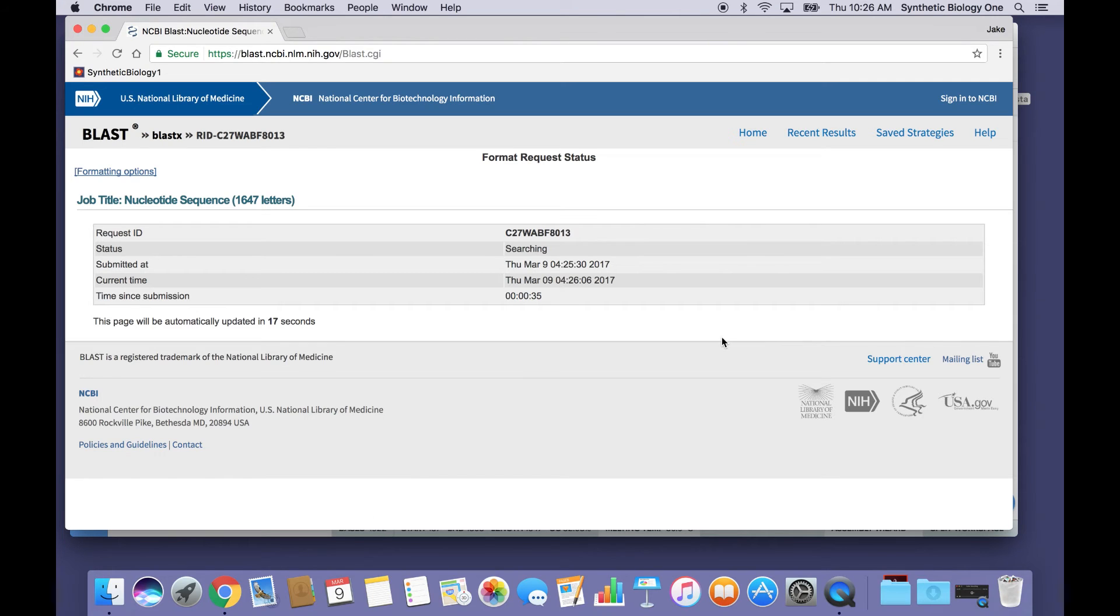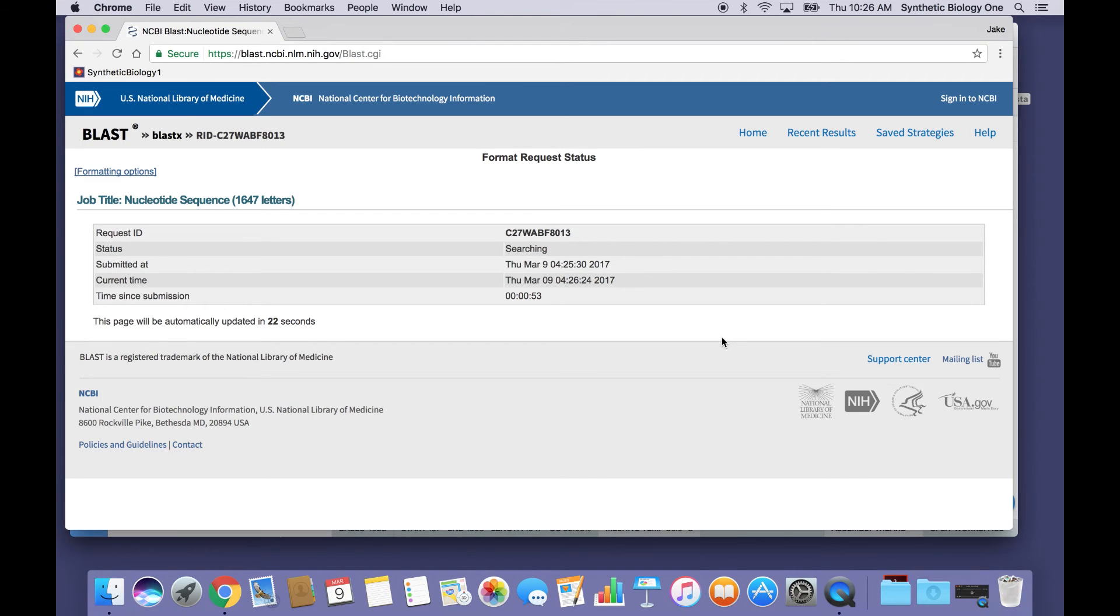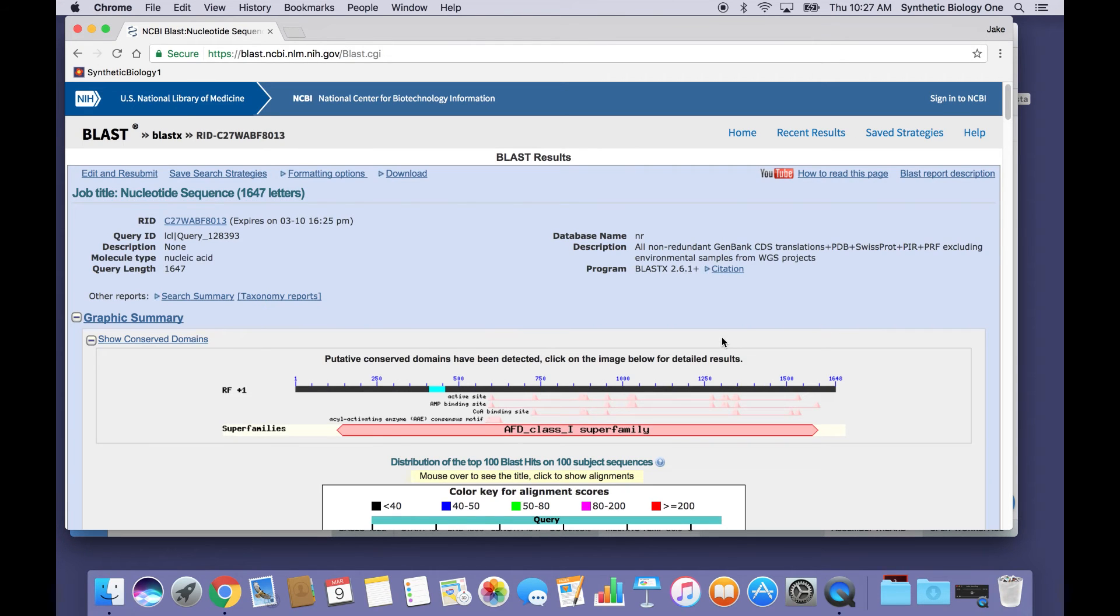And there it is. Hey, all right, looks like we found some hits.